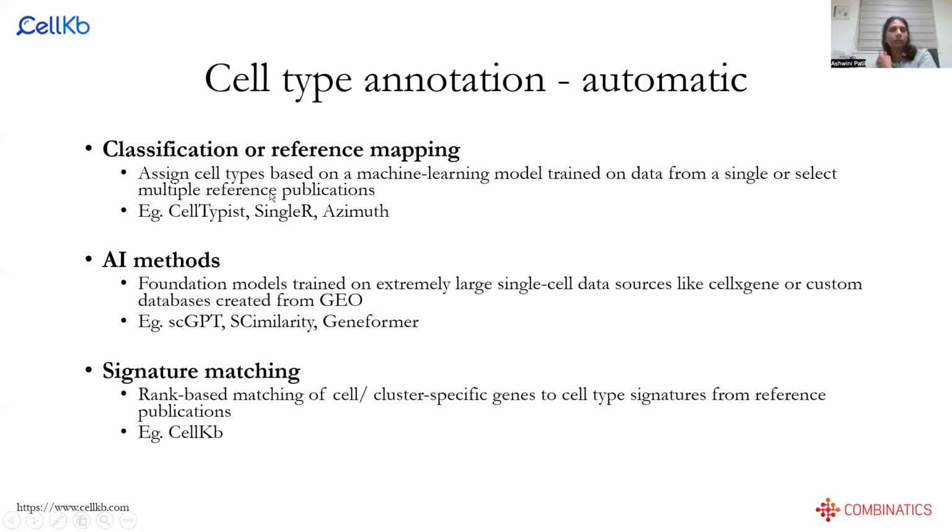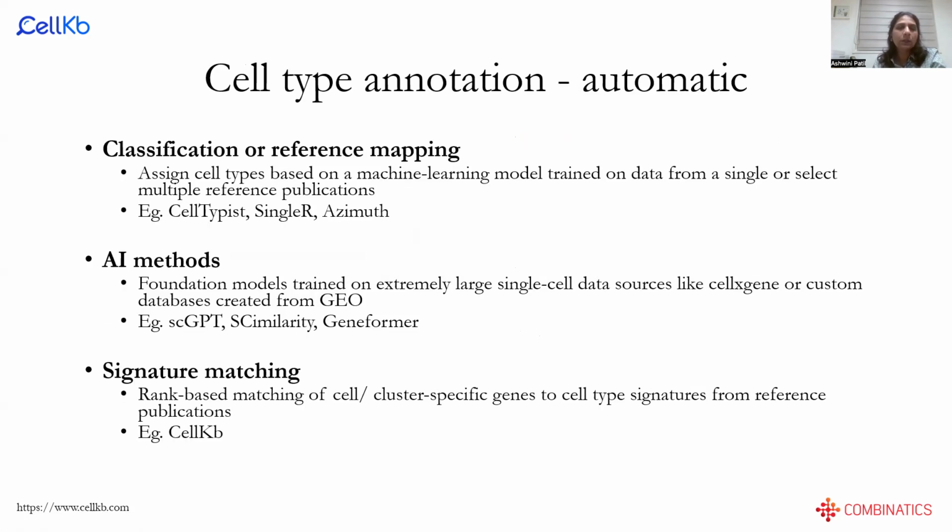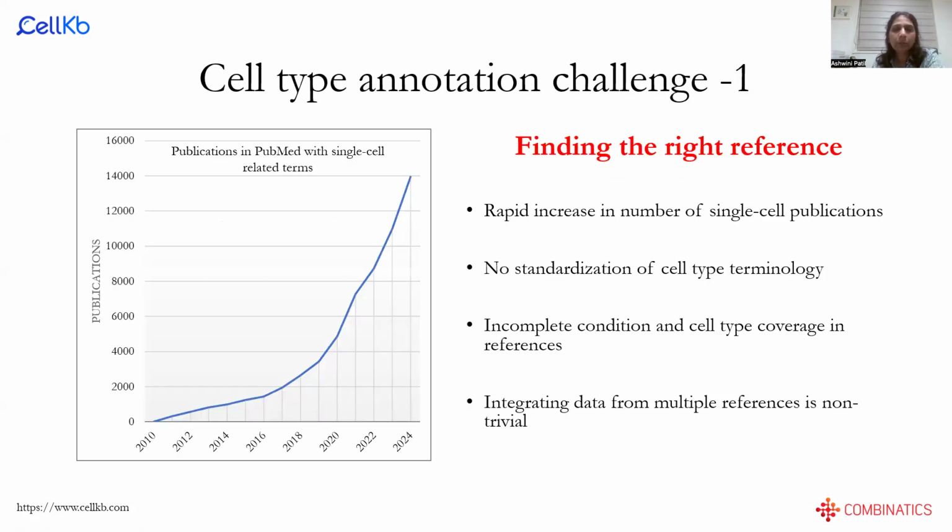I have a lot of details about each of these methods and a comparison on the CellKb blog, for which I will share a link in one of the later slides, along with results of actual runs of these tools. So with all these tools, the main problem is that it's very difficult to find the right reference.